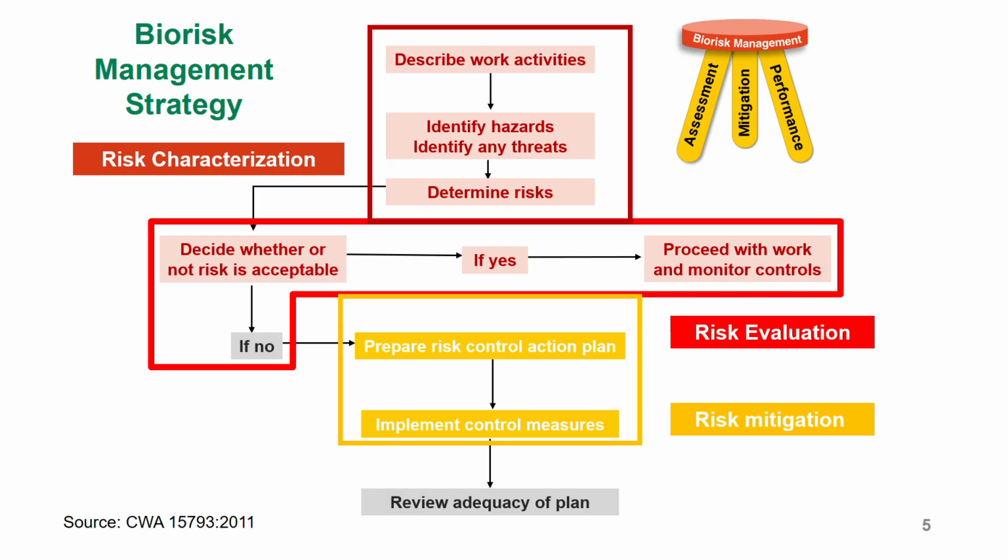So you may also want to check that part, the practices, because what you don't want is to not check if people are actually using the things the way they're supposed to use them. So you may think the class 3 is not really the heightened control measure that you need, and then you may want something even bigger than that.